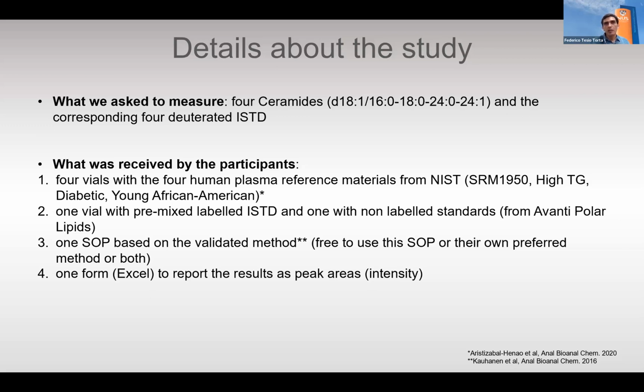There was also a template to design the sample analytical sequence and to report data at the end in a standardized format to make the final analysis easier for us. And this was included as an Excel document. But we also asked the labs to measure ceramides with their own preferred method for comparison. So labs could decide if using only the SOP that we standardized, or their own method, or both.